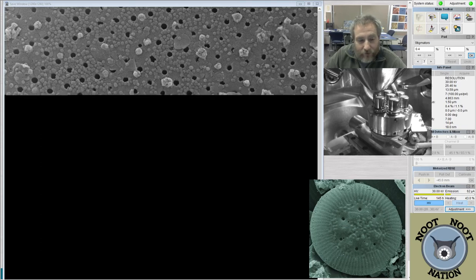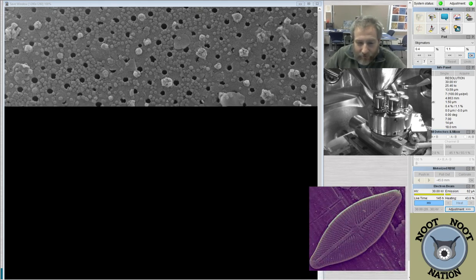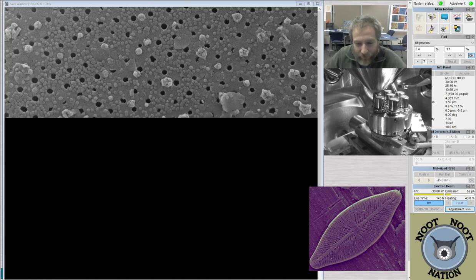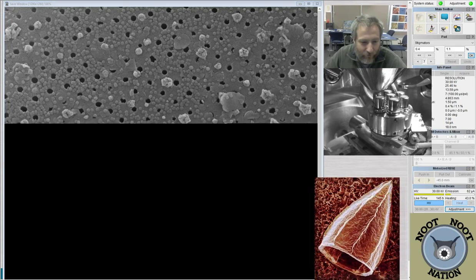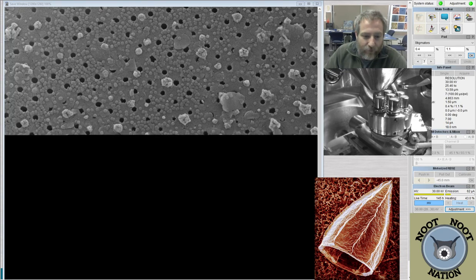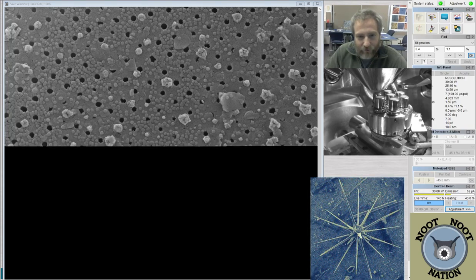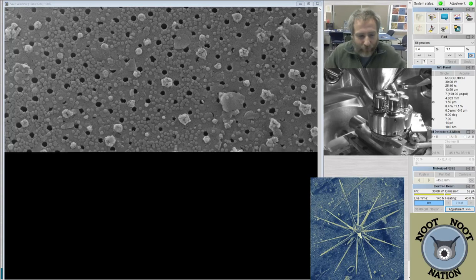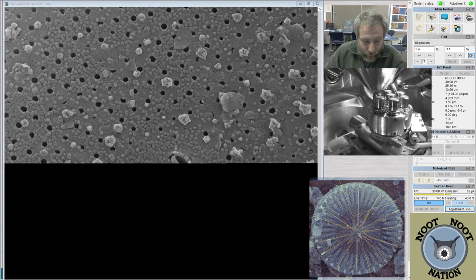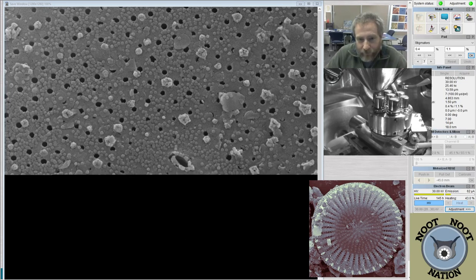When we started today, last night they told me they needed these images for the poster for today. So I rearranged what I was going to do for the stream so that we can take pictures during my stream. That way I don't have to set aside more time on the SEM than I was already planning. I sent Mallory a message, can you get the samples ready for me? And she scrambled around this morning to find them and get stubs made for me. So I'm going to say thanks to Mallory for that. Mallory is also an author on the poster, the poster that we're collecting these images for.